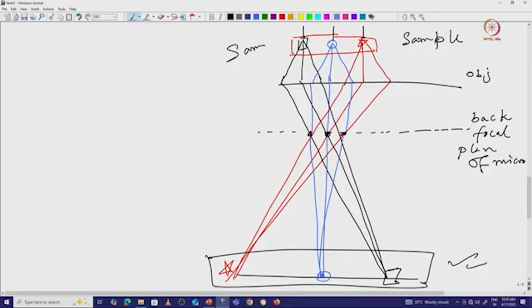The same thing is happening here, where they are scattering and converging in one particular point. Some information is scattered very strongly, and they merge far away from the center. So, they are staying away from the center and converging in one particular point, and the information is coming from the star, this circle and this square. And the same thing is happening here also: that information is scattered far away, and the more scattered electrons will come from like that, like that. So, they will converge somewhere here.